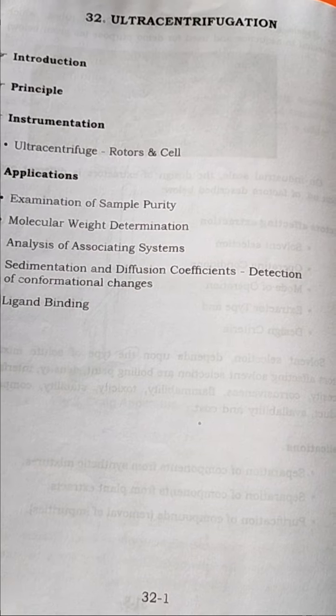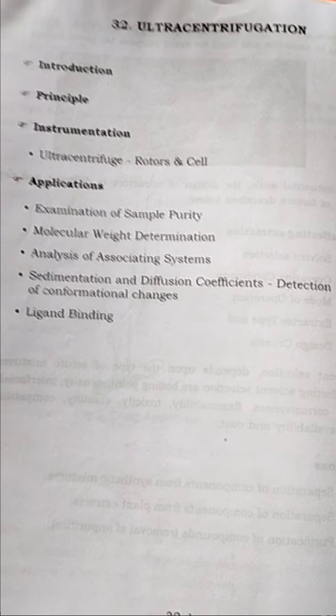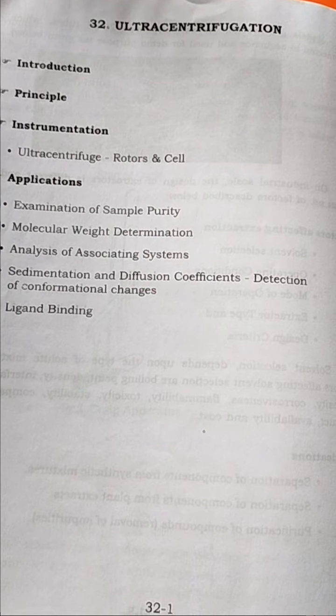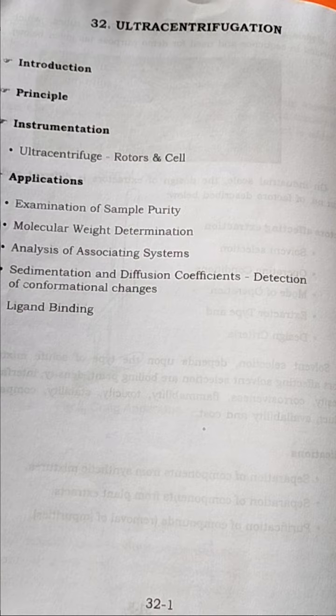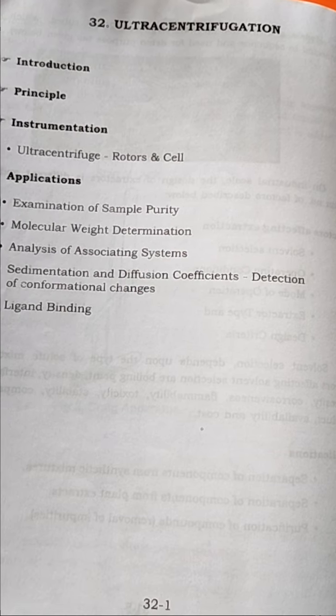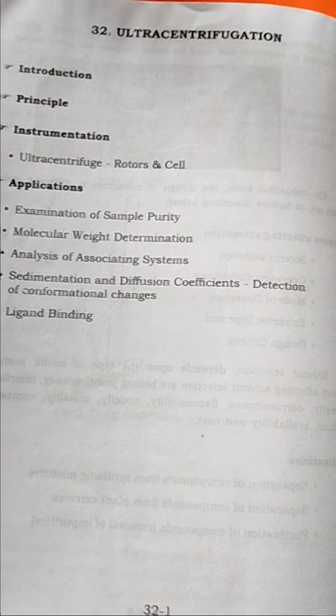Sedimentation equilibrium analytical ultracentrifugation, shortly SEAUC, is used to assess interaction and dissociation between sample components.